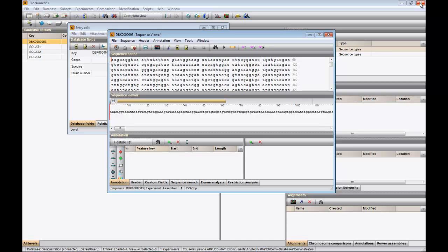How to align and compare sequence data is explained further in our other videos.